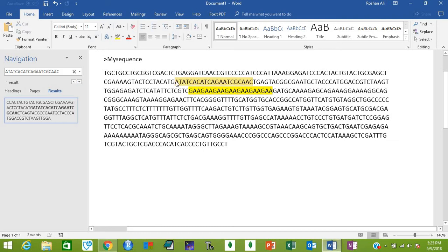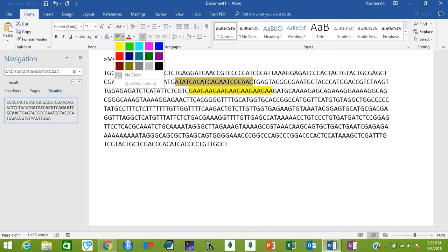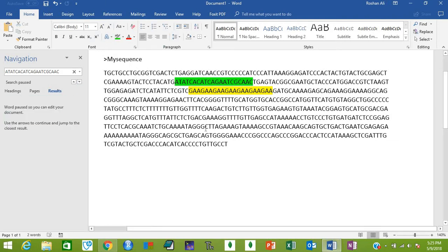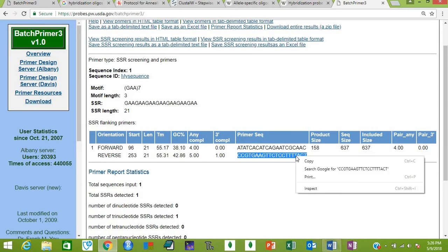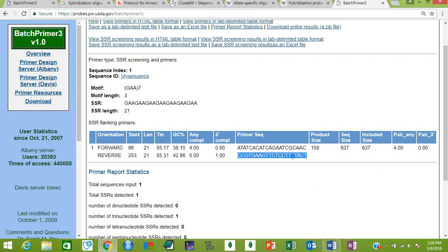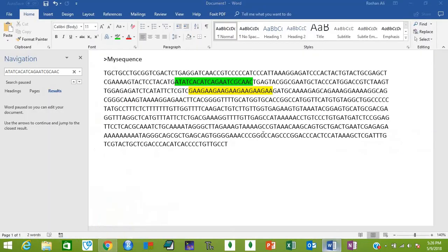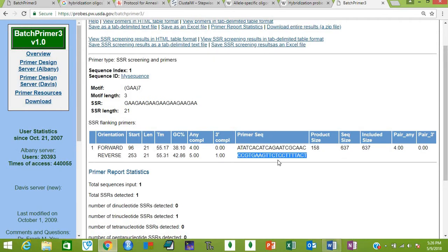Now let's go to the reverse primer. But remember that you will not be able to find this with Ctrl+F in your sequence. First you will have to find the reverse complement of this sequence.